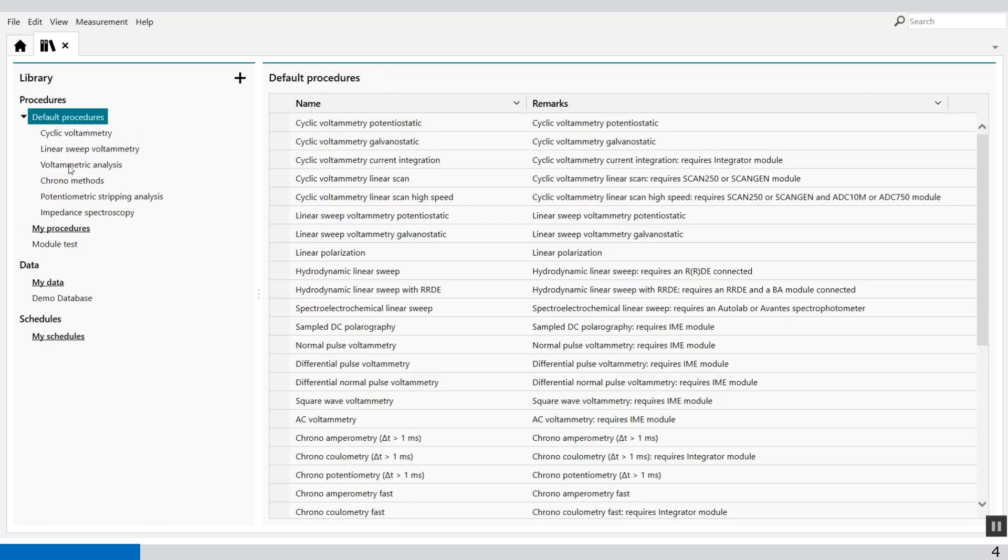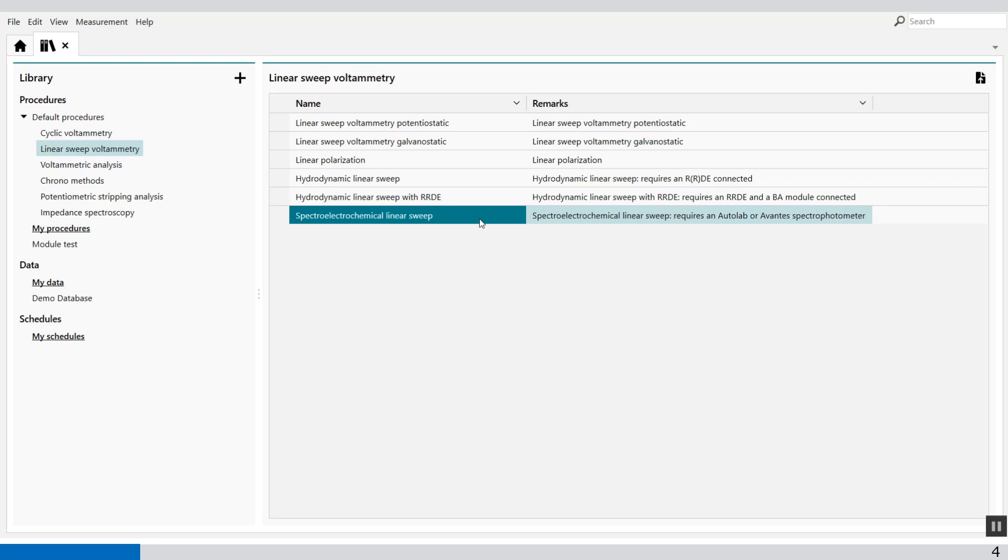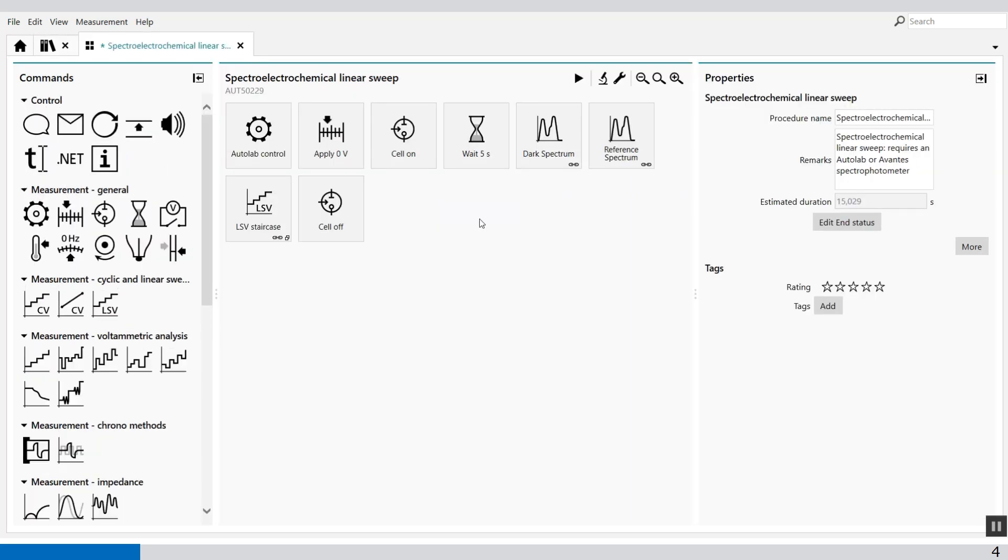and under linear sweep voltammetry you will find the spectro electrochemical linear sweep procedure. Open this procedure.